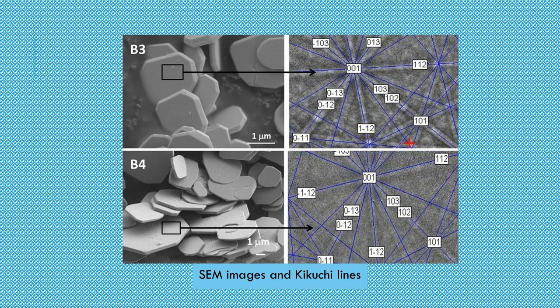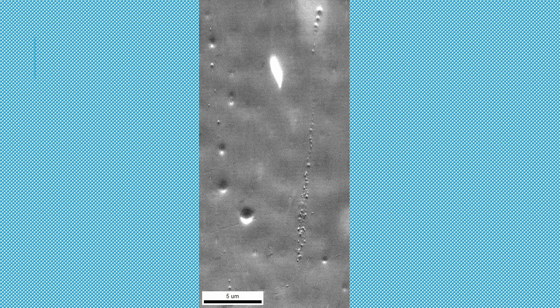In this slide you can see the SEM image of the particles and the Kikuchi lines created by the particles. In order to create Kikuchi lines and perform EBSD analysis, the sample must be polished.